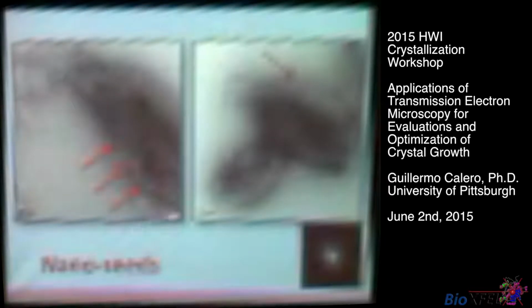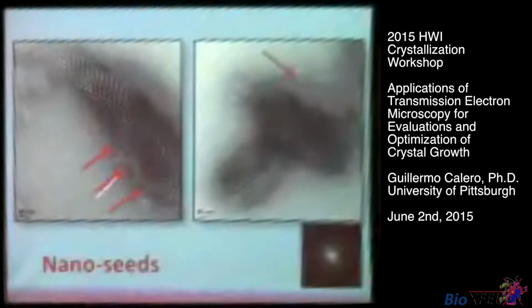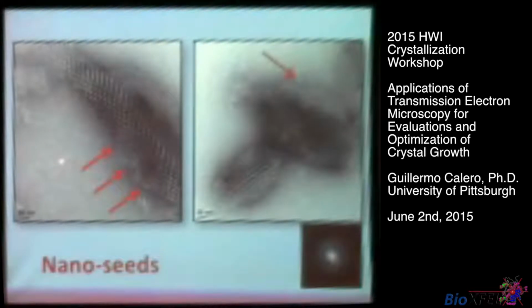And for example, here you can actually distinguish the fracture planes in the crystal. And in this case, you can actually see these molecules of polymerase, which is a really large molecule. You can see them all the way here, coming off. Now, before doing this, we washed the crystals thoroughly. So that means that this protein that you can see here, all these white particles, just came off from the crystals. And when we took an FFT of the crystal lattice, we were able to identify bright spots.